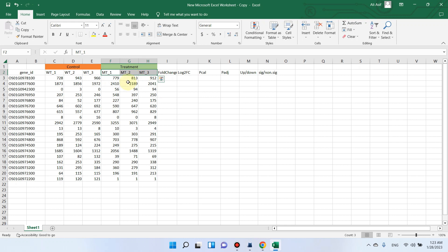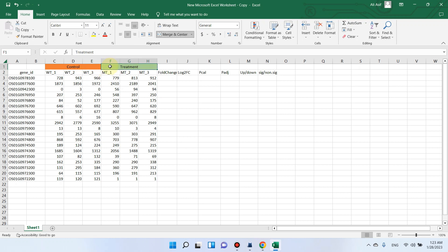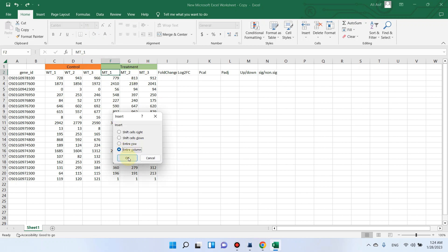Now I will show you how we can calculate FC value and log2 FC value and later on all these parameters. But before that, we should take an average of all these base mean reads or FPKM values. For this you can insert one column before both the wild type and mutant type columns.